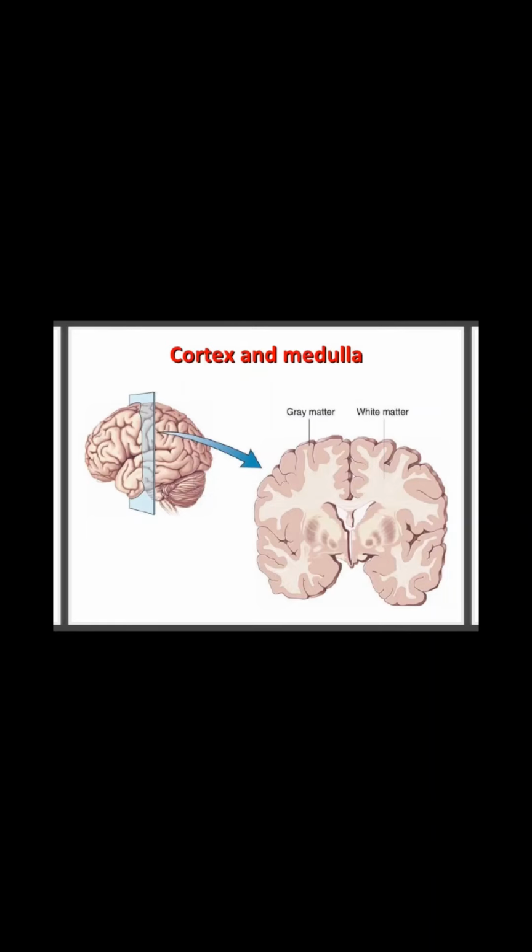that developed during the course of evolution. The remaining cortex appears phylogenetically old and is called the allocortex. The allocortex is structurally much simpler than the neocortex and comprises the olfactory cortex and cortex covering the hippocampal formation.